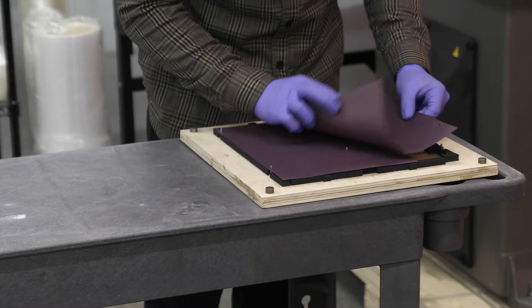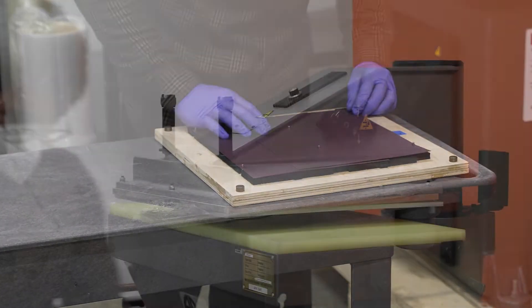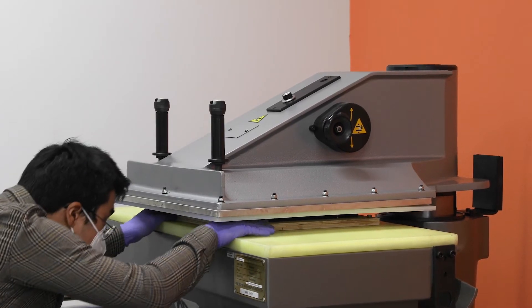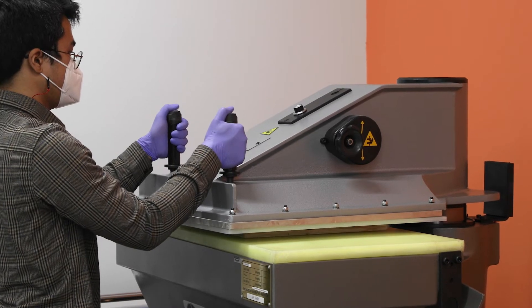Die cutting parameters help determine how quick and how much material can be processed without damaging the material or affecting the quality of the cuts. Die cutting also offers a quick turnaround to production because you are able to process multiple sheets of material at the same time.